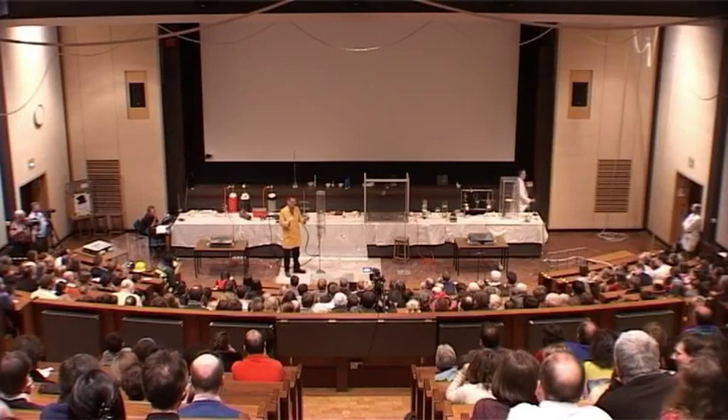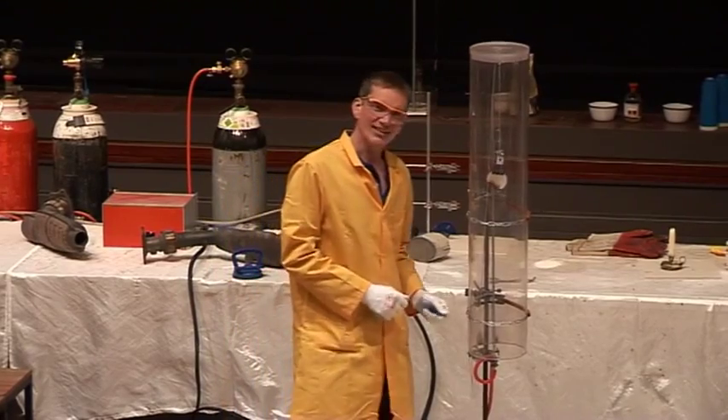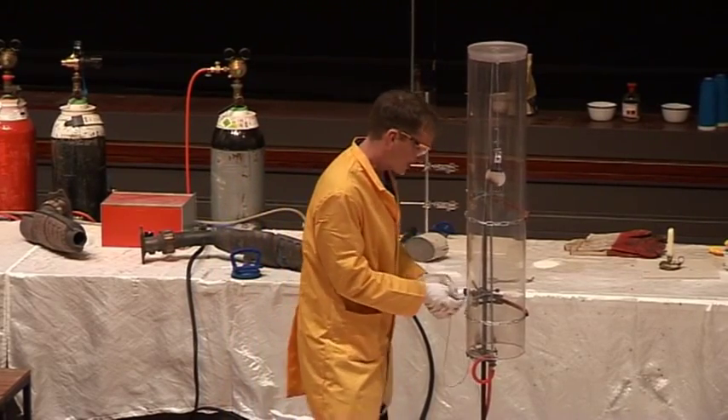Now, remember the balloon filled with oxygen, and it didn't light in air. Will it light in hydrogen? Well, let's give it a try.